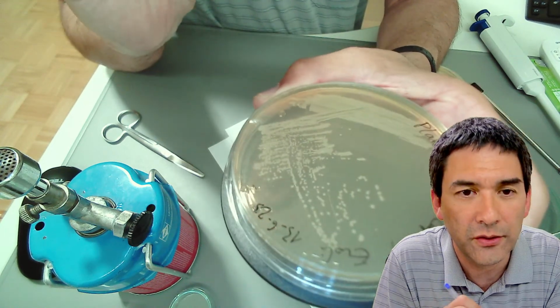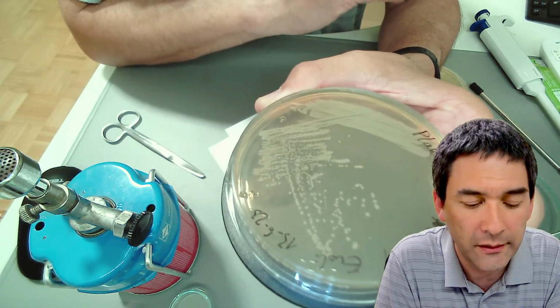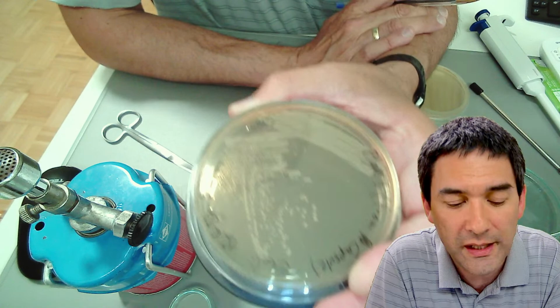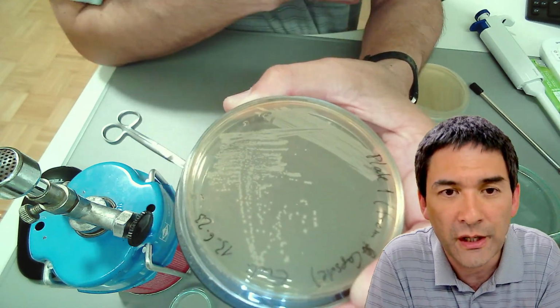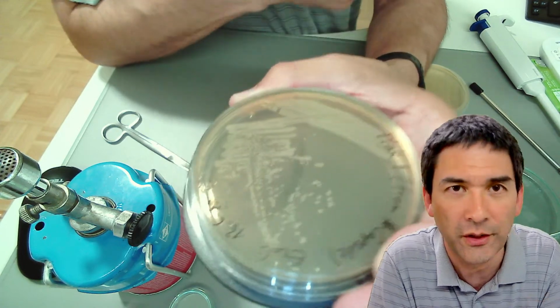And what I would like to do now is make such a dilution streak, and because we cannot wait for 2 days, we're going to then continue with this one here, and I'm going to show you with this one over here. We're going to put some bacteria under the microscope.